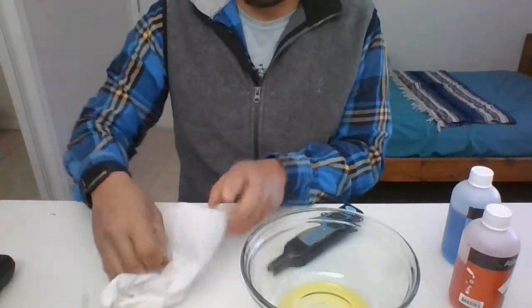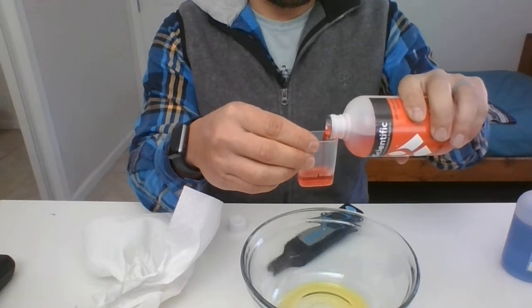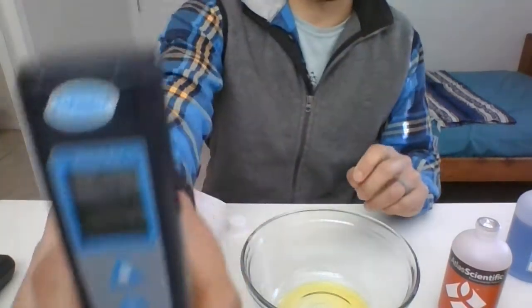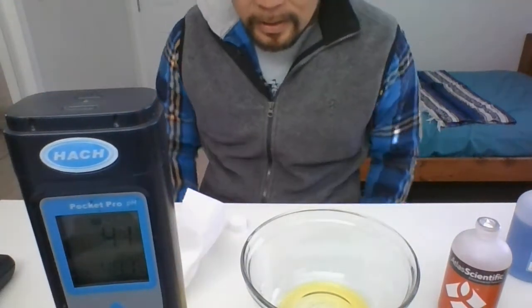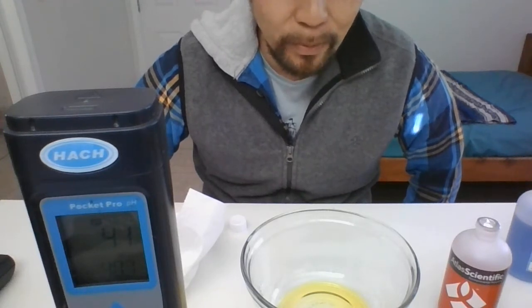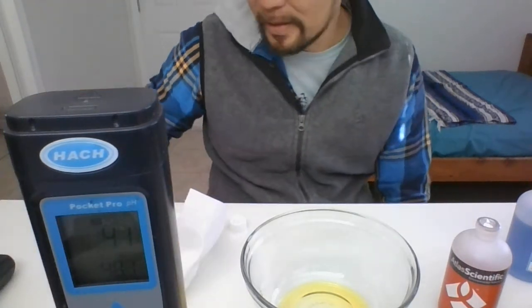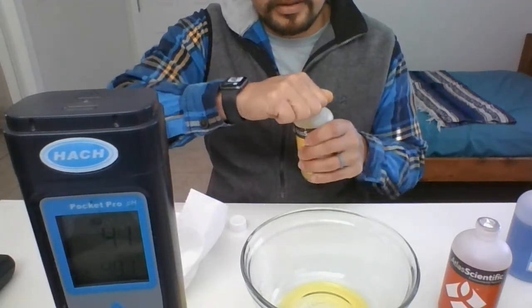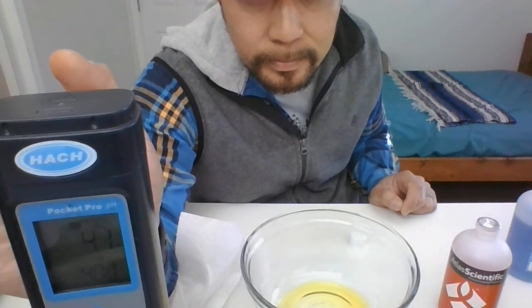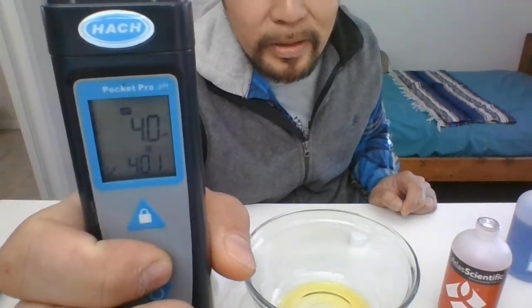You can choose either the ten or the four buffer next. I'm going to go with the four first — the red one. Fill the cap up again to the line or arrow. The reader will automatically detect whether you're doing a four or ten. Wait for it to read 4.0, then hit that circle button again. Give it a little time to calibrate. There it goes — 4.0. Hit the circle button and the 4.0 will blink.